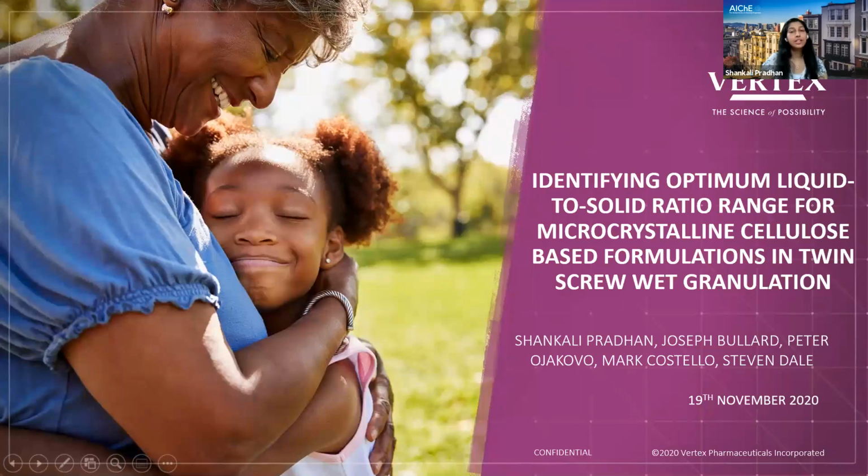Hi everyone, I'm Shankali Pradhan and today I'll be talking about identifying optimum liquid to solid ratio range for microcrystalline cellulose-based formulations in twin screw wet granulation.